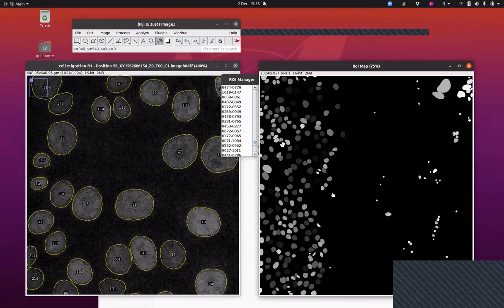Now, you're going to tell me, okay, but what happens if there is no pre-trained model available to me? Then what I normally do in the lab, so we use StarDist not only for fluorescent images, but also for bright field images, is that you annotate 10 images of cells by hand, let's say, and you do it in the same way.